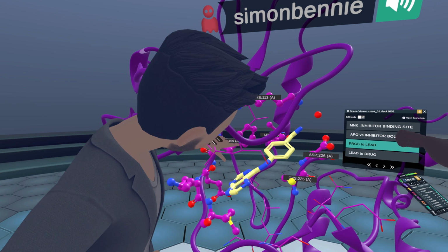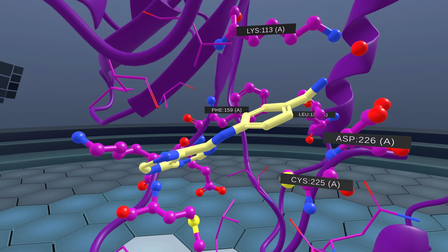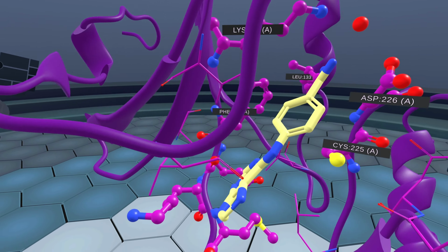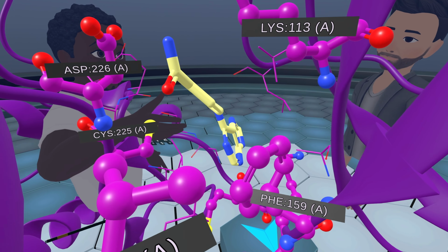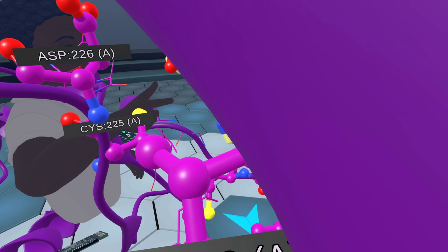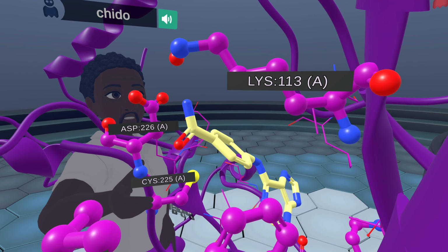There's that phenylalanine. I can see again, you got that edge face interaction with the pi system there. Exactly. So this small fragment here, which possibly would have been bought from a commercial supplier, is very easy to make, has been co-crystallized, and it was a low affinity inhibitor of Mink. It's been co-crystallized with Mink in order to find a new fold of the protein. Well, what do we mean by that?